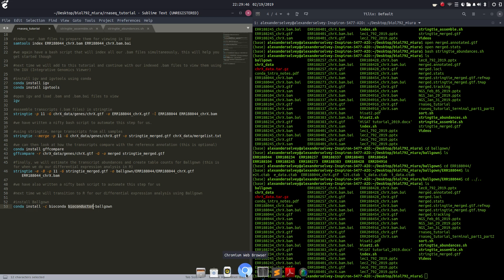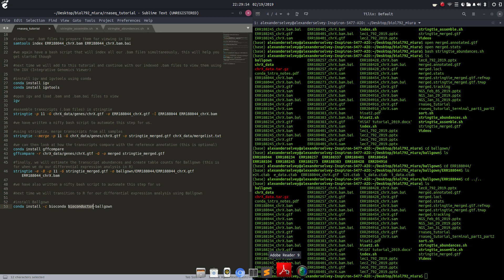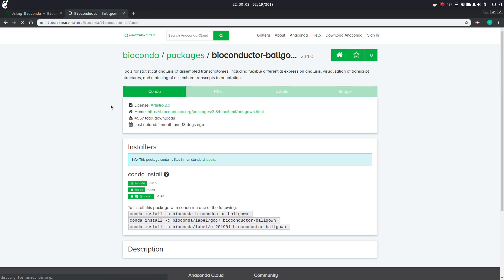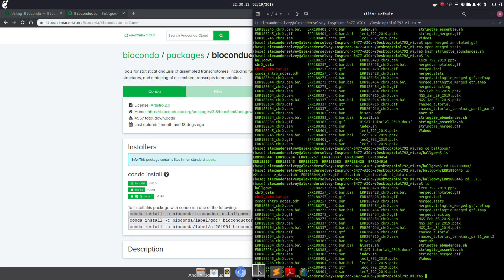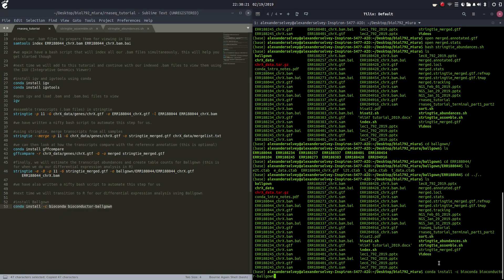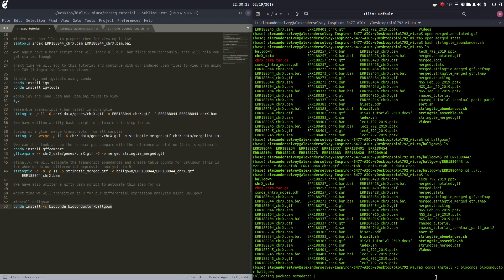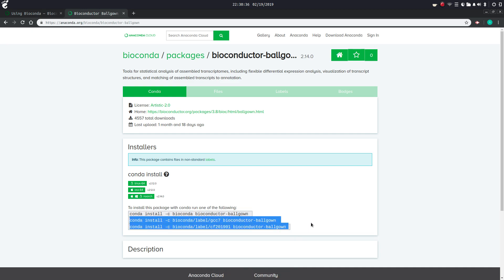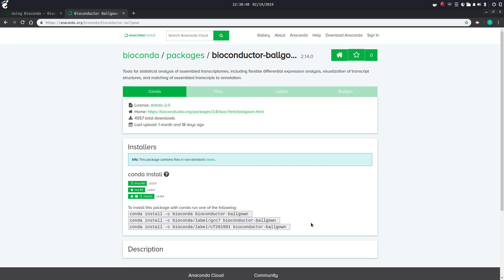It wasn't as intuitive as I thought it was going to be. I originally just typed conda install ballgown and it said you don't have the required packages or the syntax. So I did a quick search for 'install ballgown conda', came to bioconda packages bioconductor-ballgown. This is the code that worked for me. I'll run it here to show you guys. If this one doesn't work for you, there are two other commands that you can use, and one of these three commands should work.